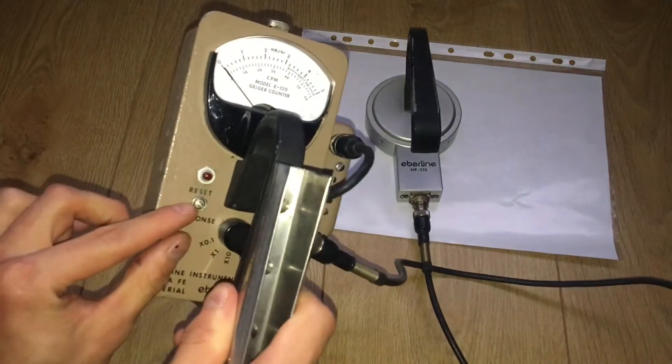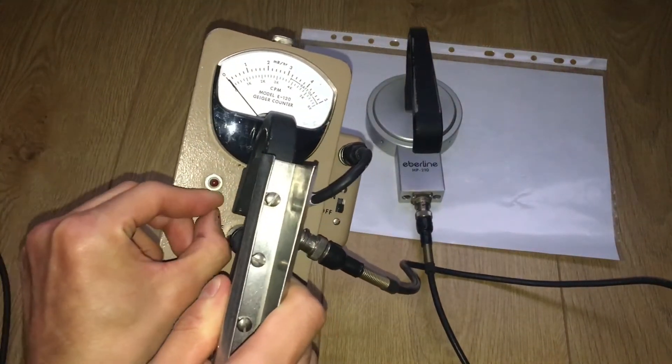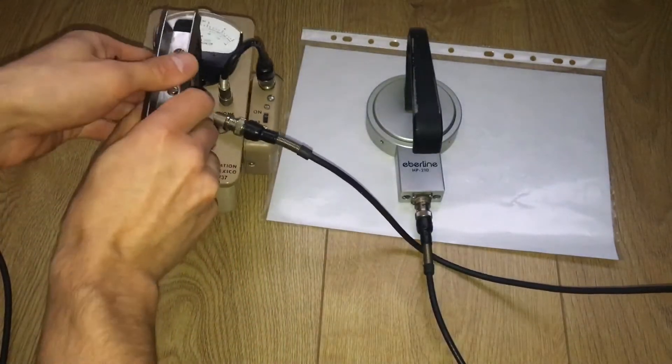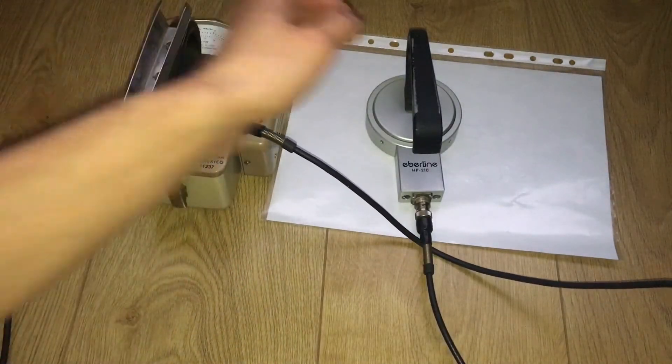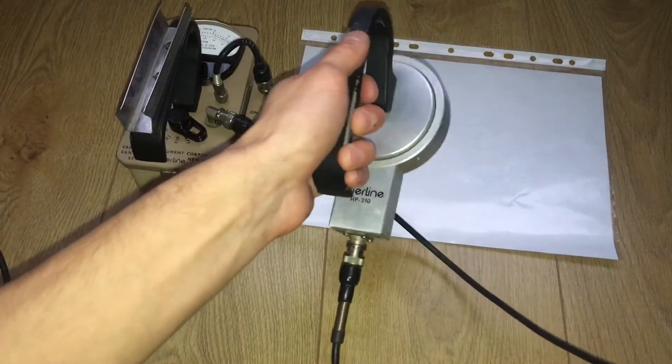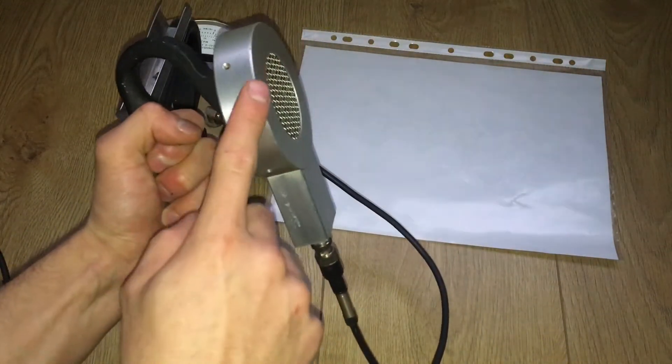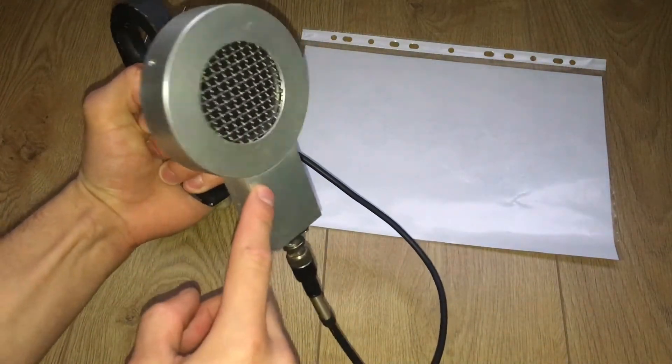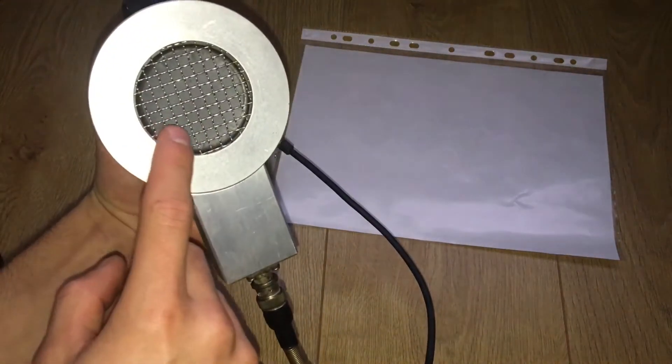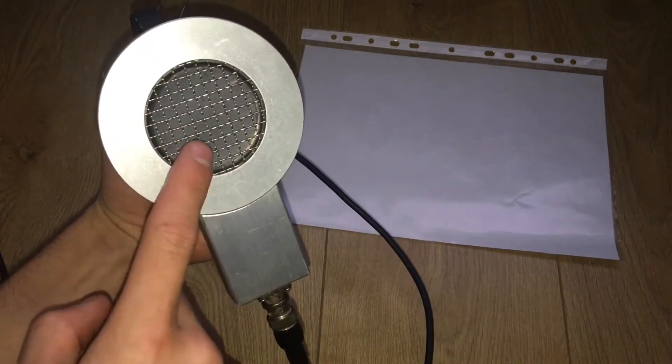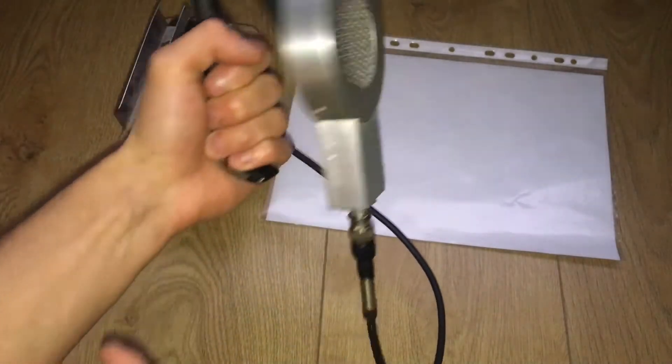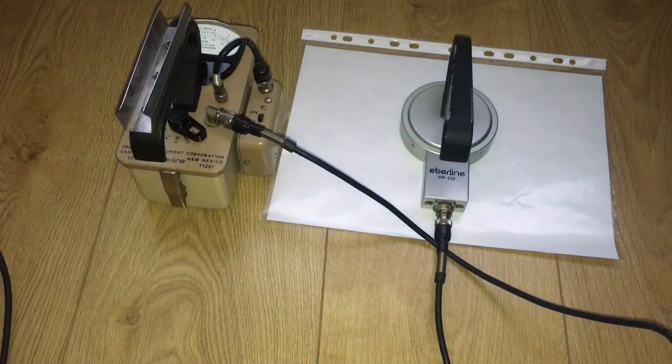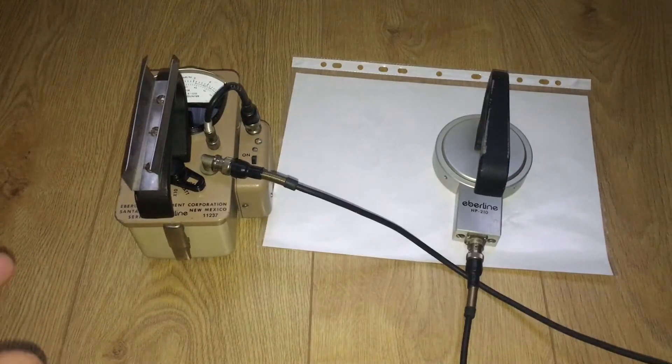The only thing it doesn't have is the dial - you can use your fingers. The probe itself feels very heavy, quite bulky, all made out of metal, and has a protector for the micro window. Now we can test the unit out.